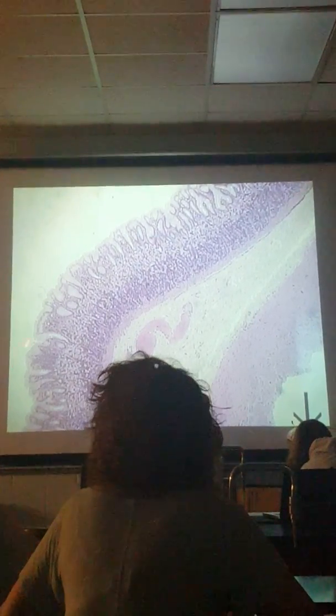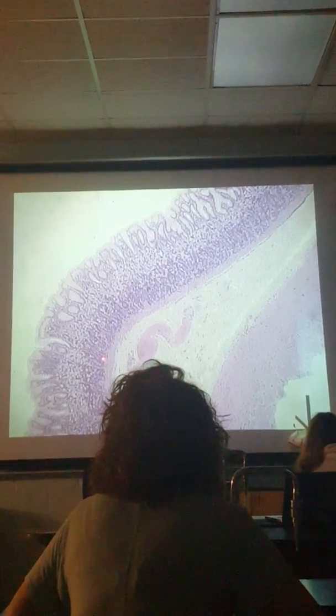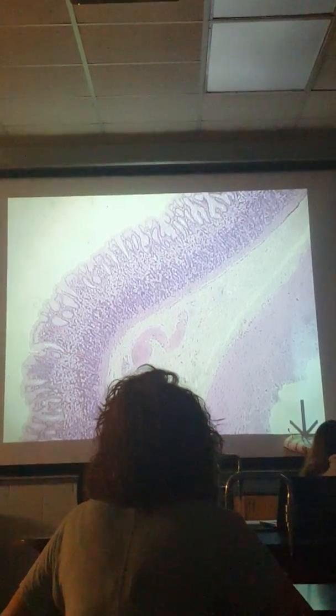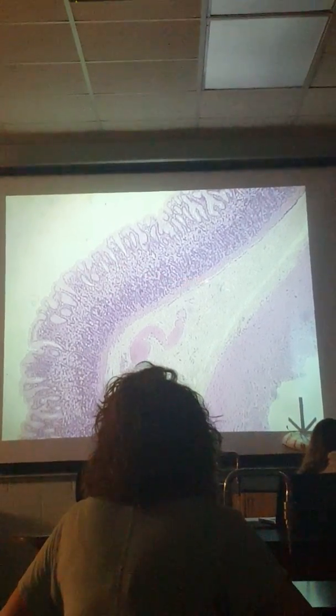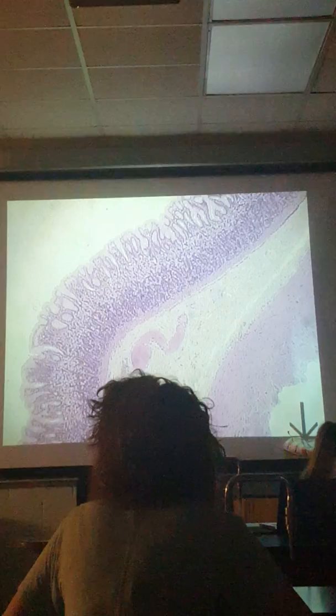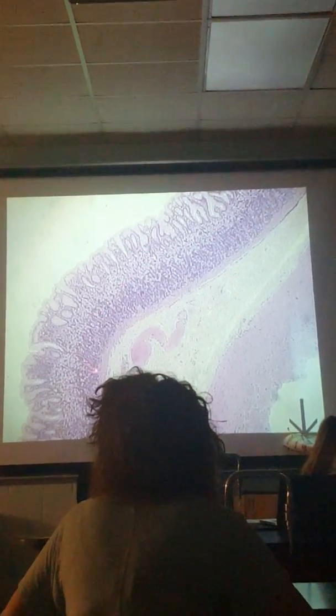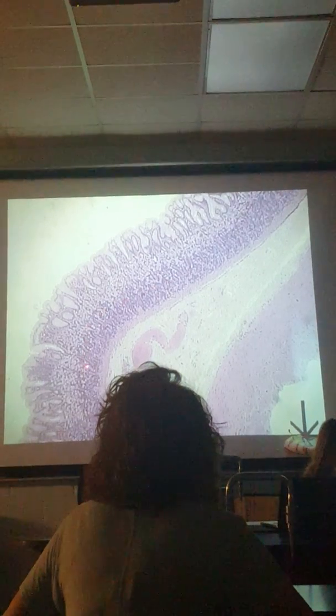You're rarely going to see this. Here we can see neck cells going down into the base of the gastric pit. It's going to be rare that you see an entire gastric pit from start to finish, because it's 3D and everything's all squished around. But you can see the darker staining down here, so these are more active cells.